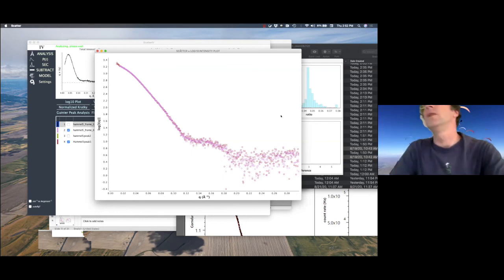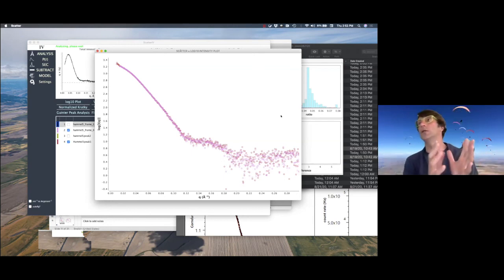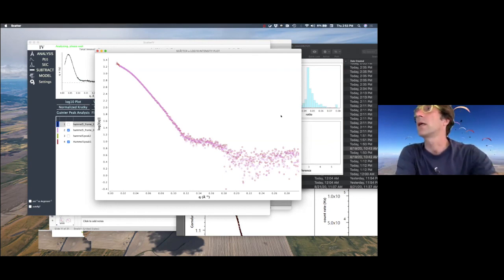So what does it mean? It could be the flexibility unfolding problem, that your molecular weight, or your radius of gyration, is not well defined because you have aggregations. And partially, some of the techniques are not weighting so much the small Q region as the Porod volume does. And the volume of correlation is somehow a crossover in between. So it's a really good question. You need to watch out if it's unfolding, or it is a problem with slightly aggregated samples that can cause the difference between those three techniques that are in a Primus.